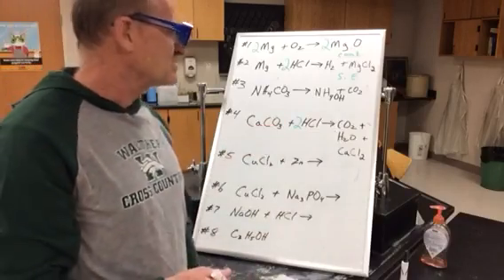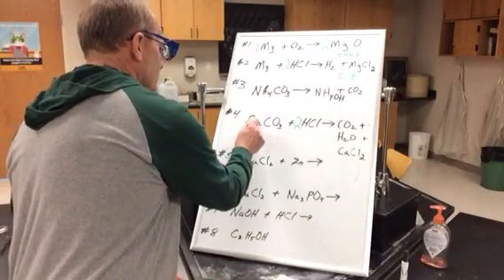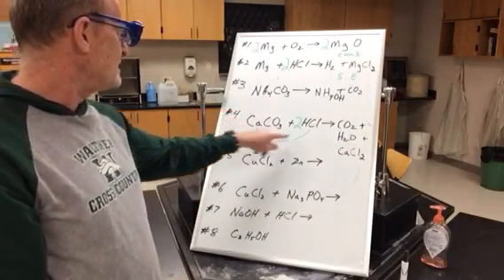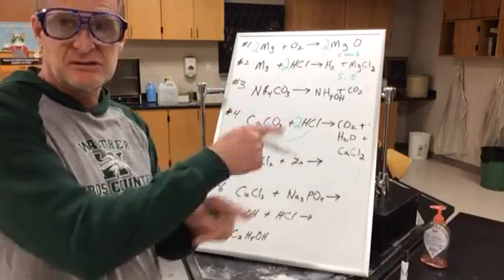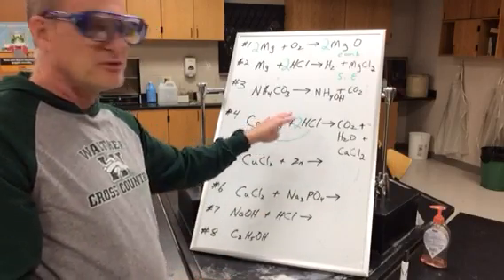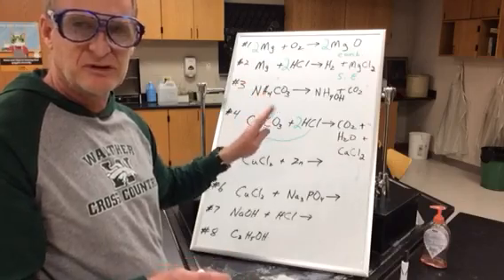Well, what kind of a reaction is that, though? All right, what kind of a reaction? Well, if you notice, it looked like the Ca and the Cl kind of bonded together, right? And that could happen if the Ca and the H switch positions. So that's that exchange, right? But then what happened with the H and the CO3? Well, there's a couple things that happen in there, and this is an example where maybe this reaction doesn't fit our pattern of one of the 5 perfectly.